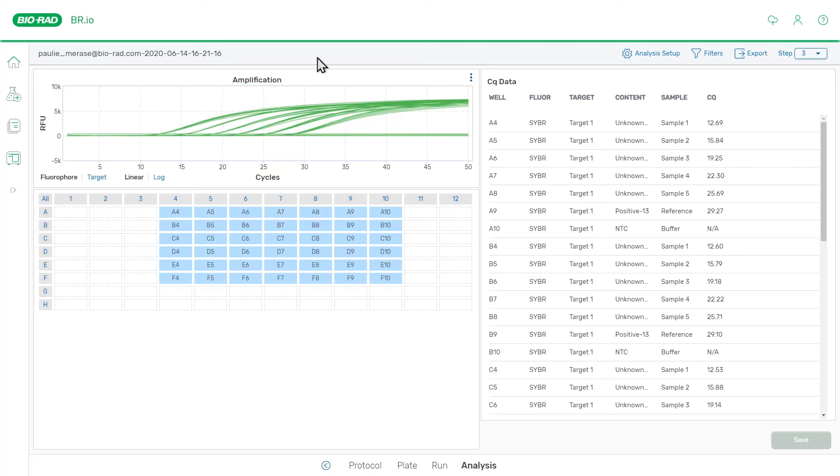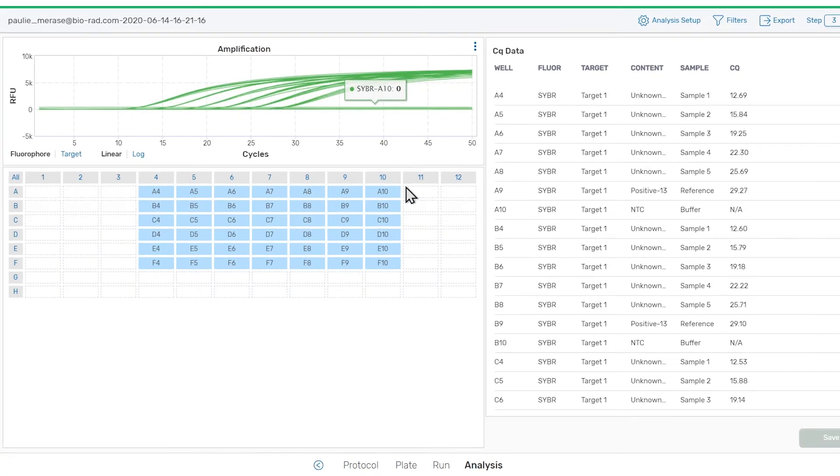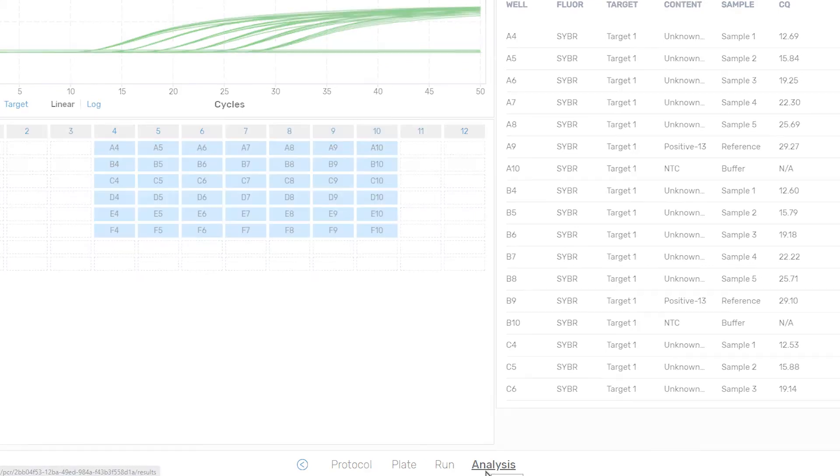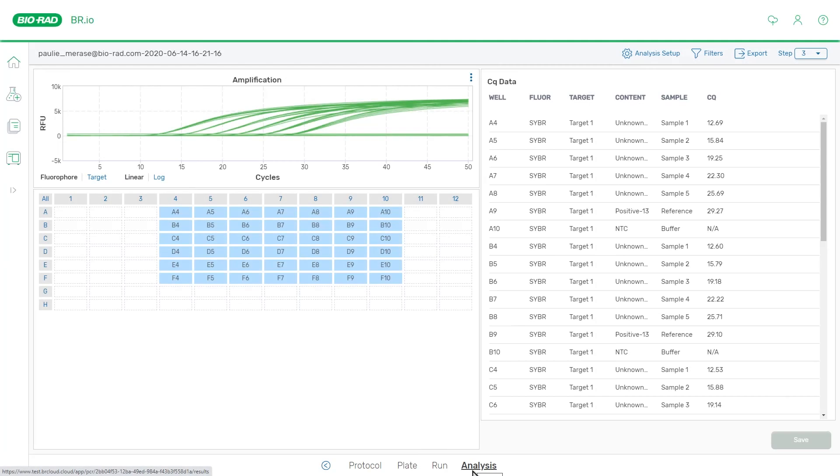Upon opening the run, you'll see that you're on a new step in the workflow navigator, the analysis step. This step is only present once the run has completed. Now let's take a look at the analysis page.